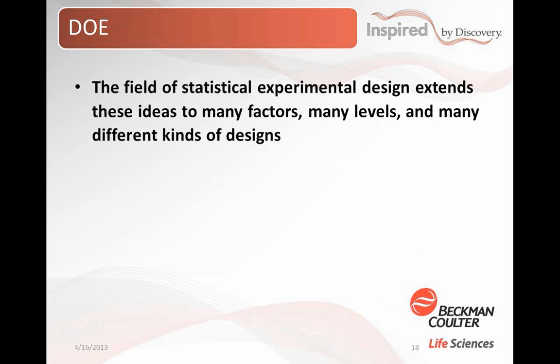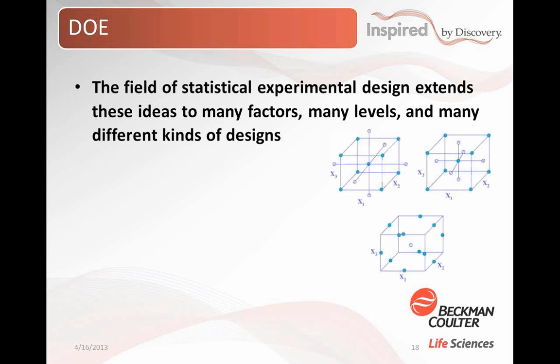So there's an entire field of mathematics surrounding this called statistical experimental design, and it extends these ideas to many factors, many levels, many different kinds of designs. So you can look at it as a far more complex thing than what we just did, but I wanted to give kind of a quick intro there.